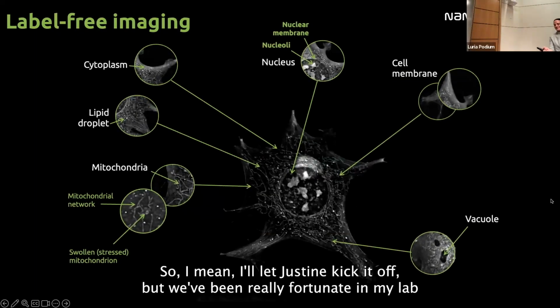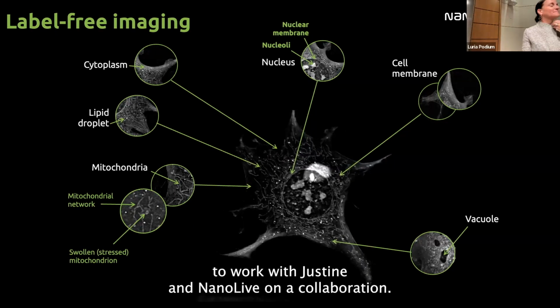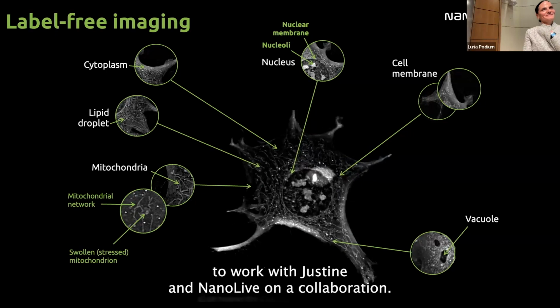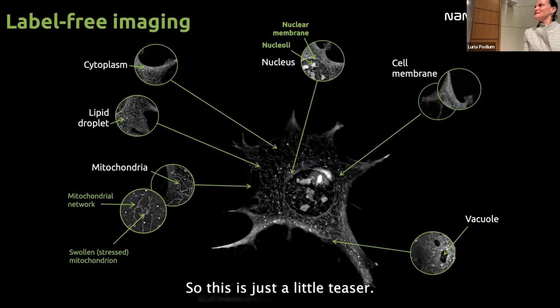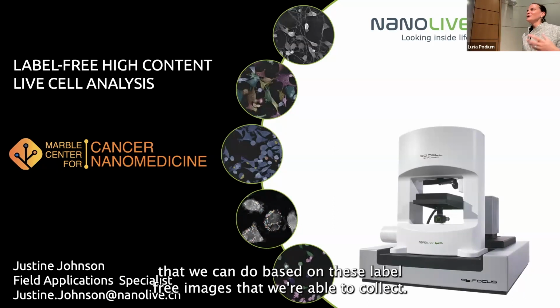All right, so I'm going to let Justine kick it off, but we've been really fortunate in my lab to work with Justine and NanoLive on a cool collaboration that we want to get everyone's feedback on. Yeah, so this is just a little teaser. We're going to talk about some live cell imaging today, as well as the analysis that we can do based on these label-free images that we're able to collect.